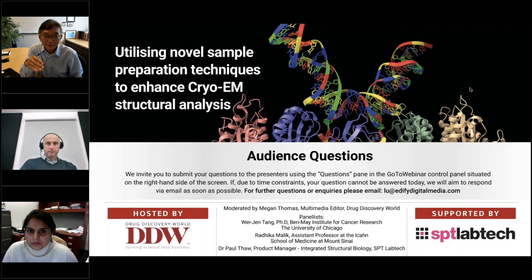For cryo-EM, I have learned something counterintuitive. You actually want to run the sample through gel filtration to get a unique peak. You take that sample directly onto the grid instead of trying to concentrate. Every time you concentrate, you cause problems because it causes aggregation. In one example, if you concentrate, the protein just doesn't behave. That's common in the field.